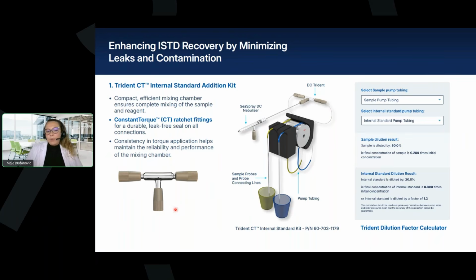And here, if you want to or need to understand how much your sample or internal standard is diluted, you can use this Trident dilution factor calculator that is available on our website, and it can provide you the estimate of this dilution factor based on the selection of your tubings.